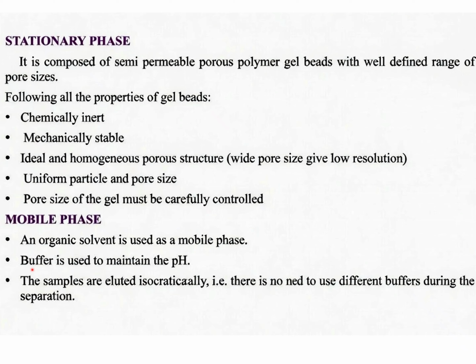So why buffer? As we discussed in our protein lecture, a protein has an isoelectric point, and at the isoelectric point the protein remains stable. Whenever you change the pH, its nature will ultimately change. Even by changing the pH, your protein may get denatured. So it is very critical to maintain proper buffered conditions for the protein sample, because protein structure is very sensitive. It has a 3D structure.